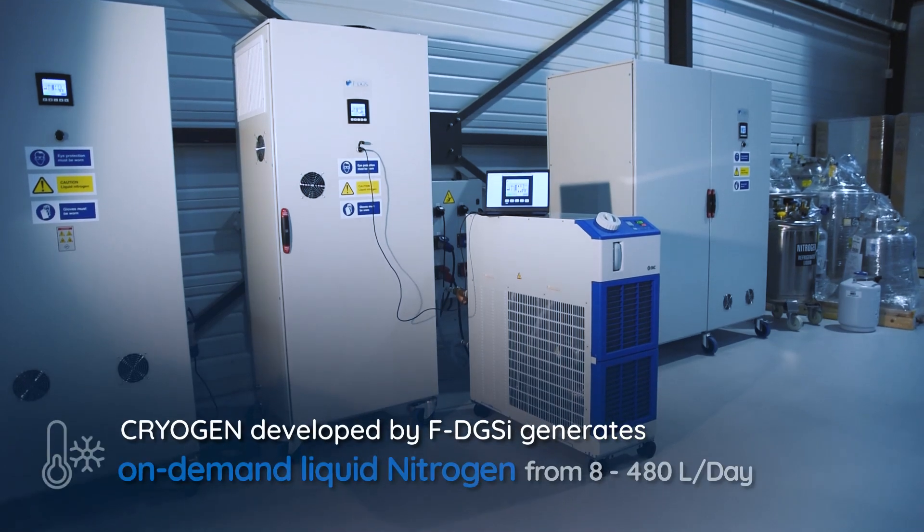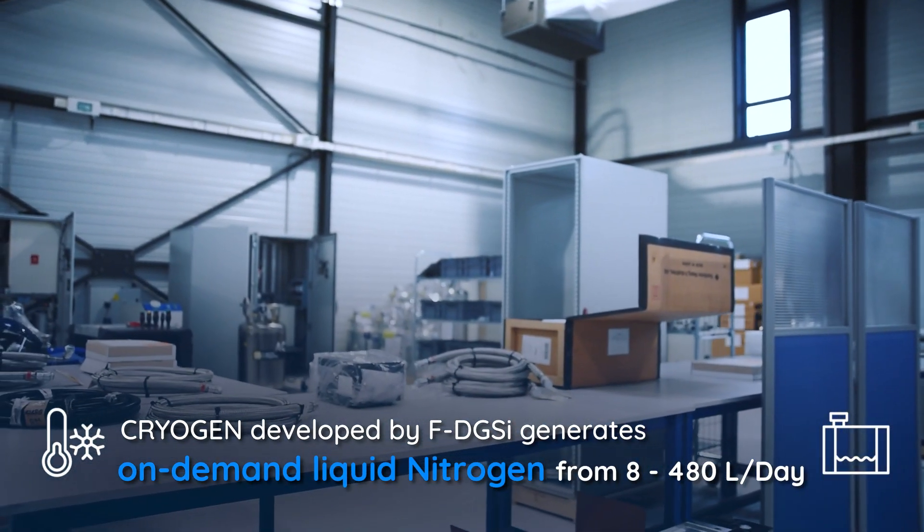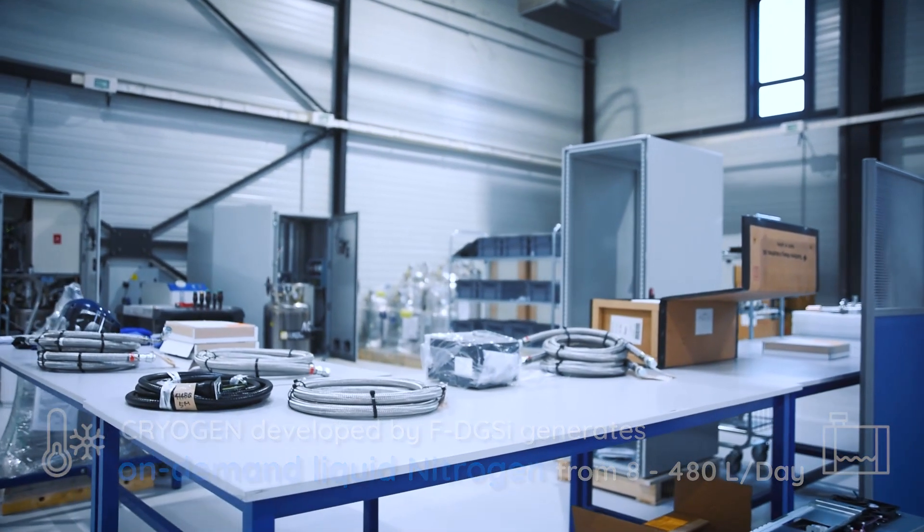Cryogen developed by FDGSI generates on-demand liquid nitrogen from 8 up to 480 liters a day.